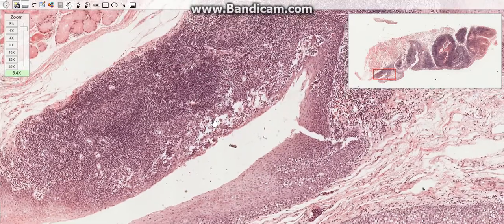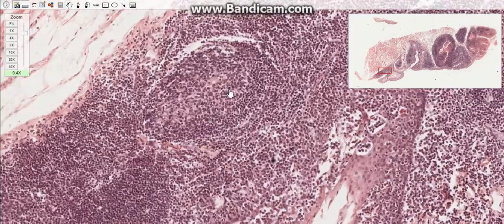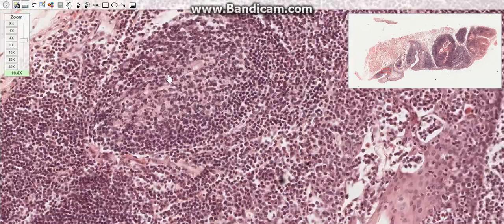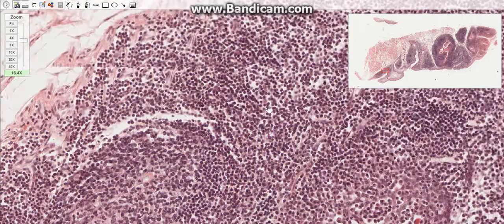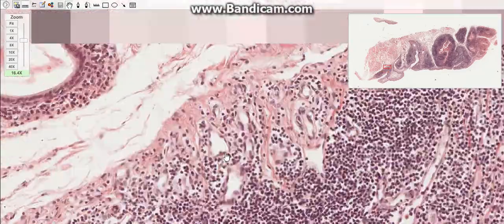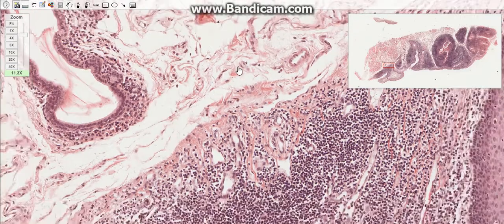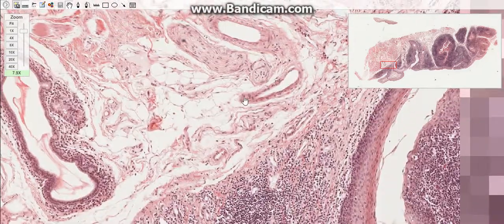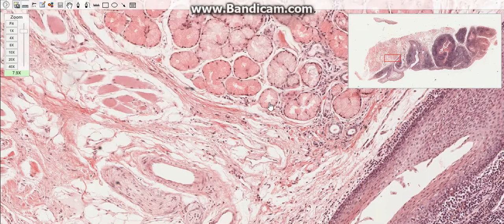The tonsils contain numerous lymphoid follicles, also called lymphoid nodules, with a germinal center which is the lighter part of the lymphoid follicle. There is also the lamina propria, which has numerous connective tissue cells. At the base of the tonsils, located on the lower part, there are blood vessels and salivary glands.